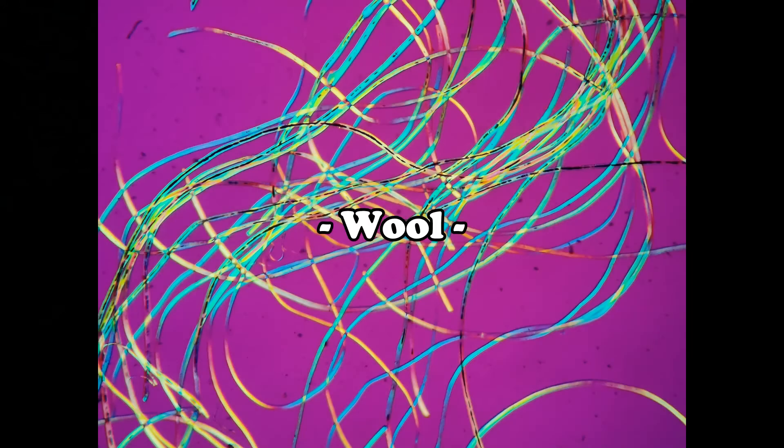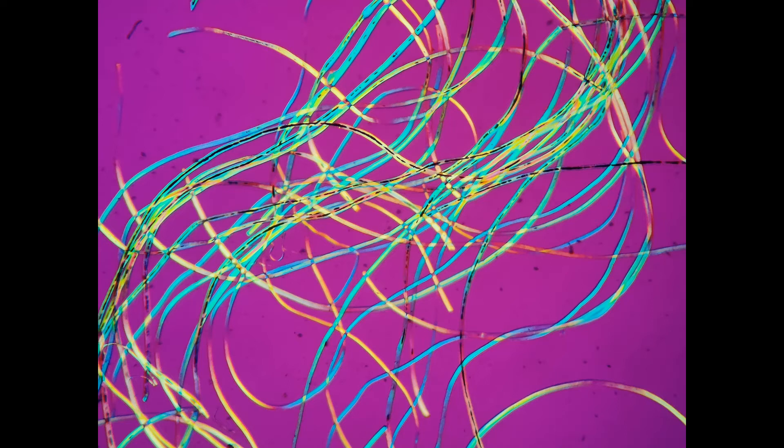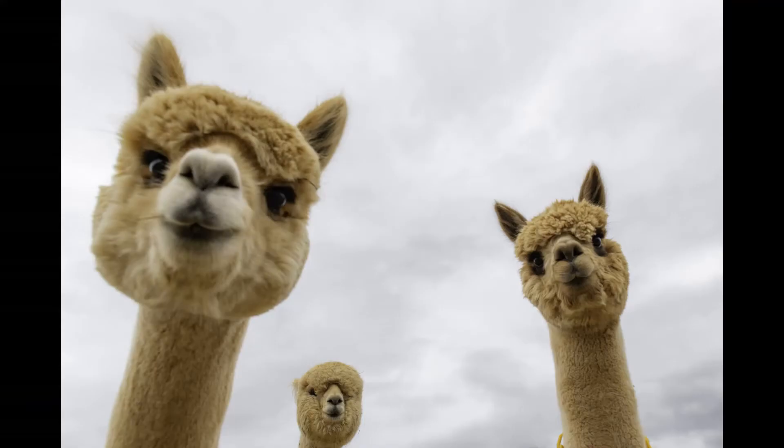I promise this is the last fiber of this tutorial, and although it is a pesky fiber to identify, its use warrants discussion. Here we have wool, which, unlike cotton, silk, or the synthetics, is mammalian hair harvested from one of several animals, including sheep, alpaca, and goats.